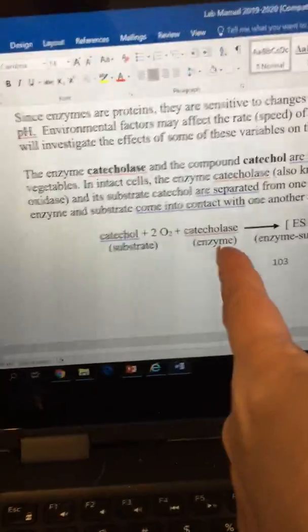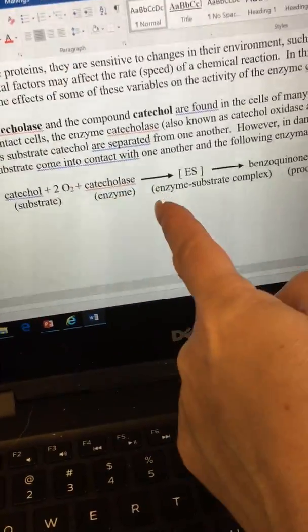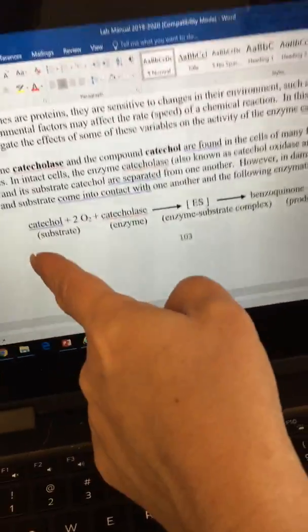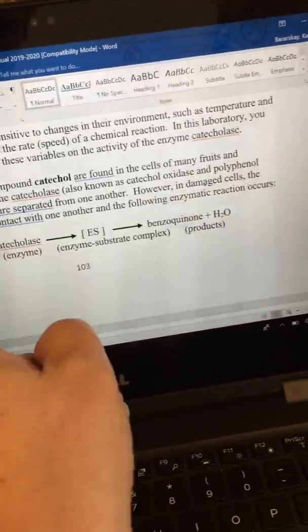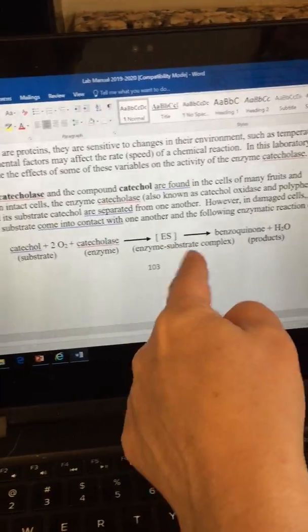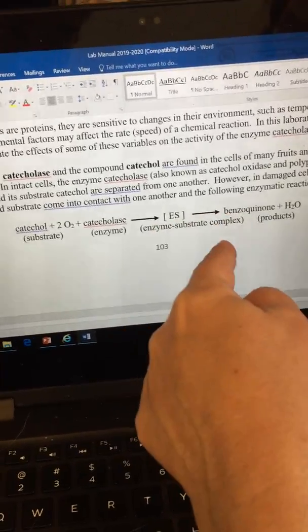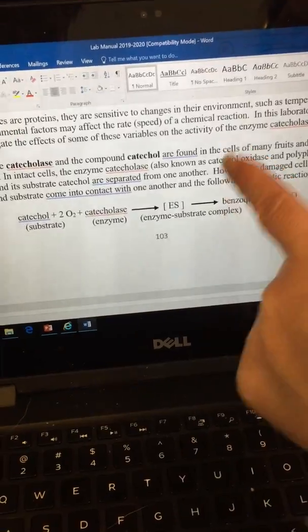We add to our test tube — which has our catechol — the enzyme catecholase. Catechol will bind specifically to catecholase and form the enzyme-substrate complex. Catechol bound to catecholase is the enzyme-substrate complex, and then we will get our product.